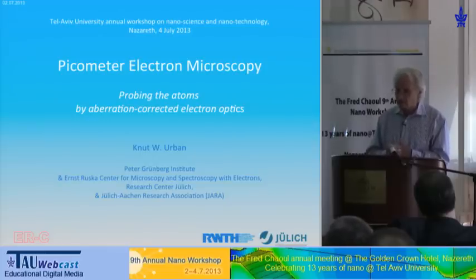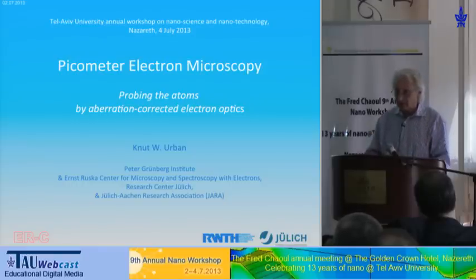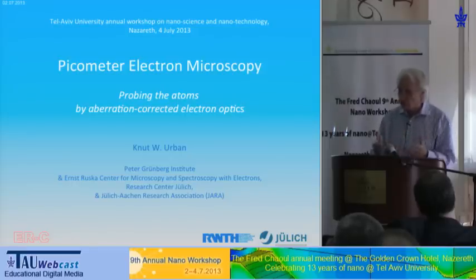Actually, during this talk, we shall drive microscopy to the extreme. That means we want to do picometer electron microscopy, which means that we want to measure atomic positions or atomic displacements in the picometer range. And just to recall, a picometer is just 1/100th of the diameter of the smallest of all atoms, the hydrogen atom.